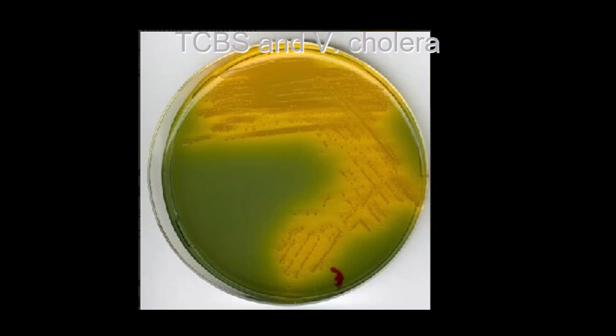Here an alkaline type of media, because the pH is usually between 8 to 9, and then we isolate them on a selective media, one we call TCBS, thiosulfate citrate bile sucrose agar, and then they appear yellow in color, as simple as that. So this is the selective media, the TCBS, for the isolation of Vibrio cholerae.